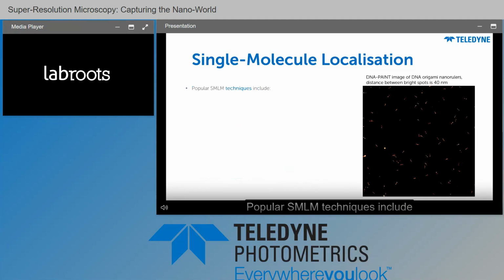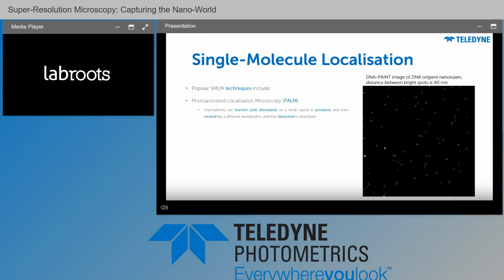Popular SMLM techniques include PALM, or photoactivated localization microscopy. This is where the fluorophores are inactive until stimulated, so you can activate a small subset, and then excite them, and then you can bleach them to deactivate them, and then repeat.